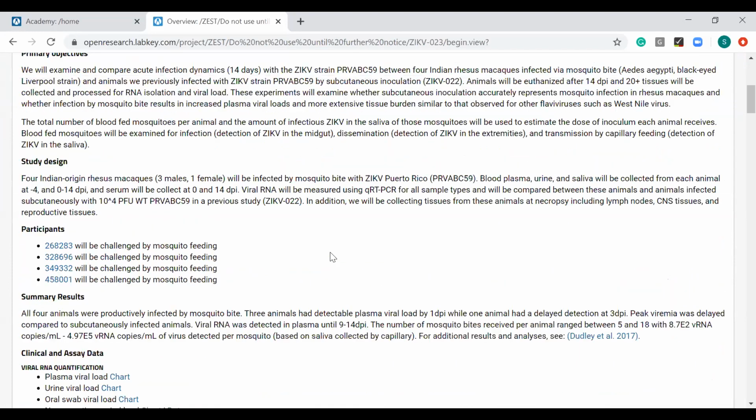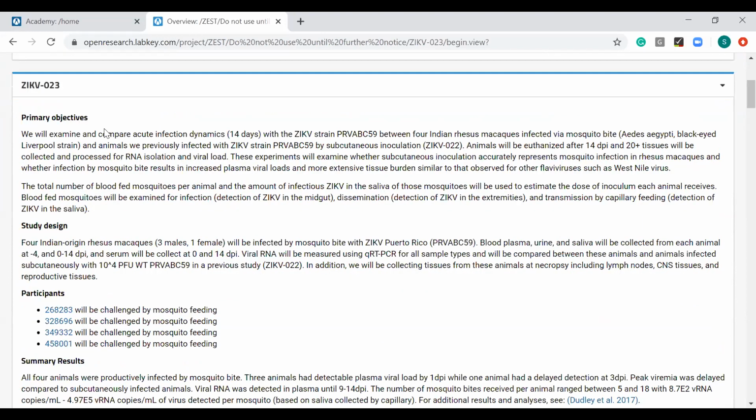Let's also drill down a little bit more here. These panels in LabKey are called web parts. And Jason mentioned earlier that LabKey is a giant toolkit. That's right. And these panels are the tools. There are hundreds of these panels inside the server.